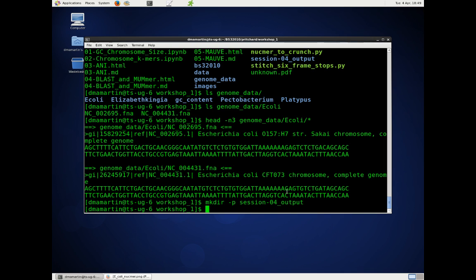Now, you heard in Dr. Pritchard's lecture about using BLAST, and if we use BLAST to compare the big sequences, it will use the MegaBLAST algorithm, and that should probably be pretty quick. If you're looking at the script, you'll see that you can run blastn -h to see what kind of options that takes. So let's try that.